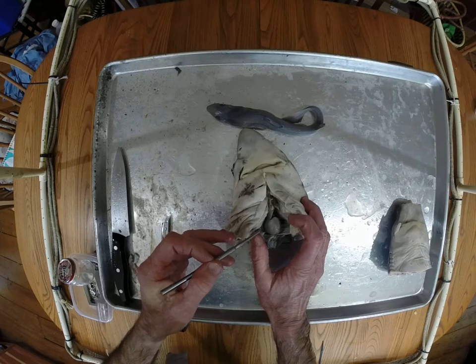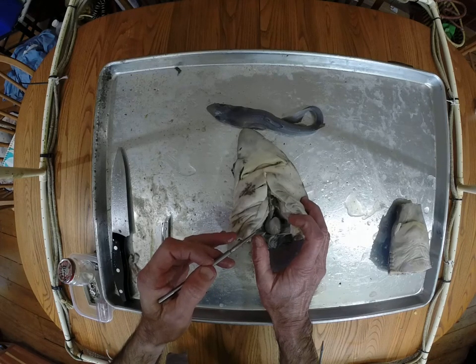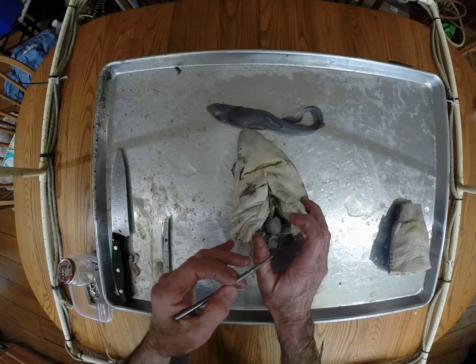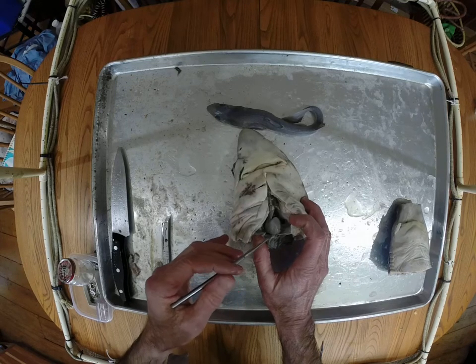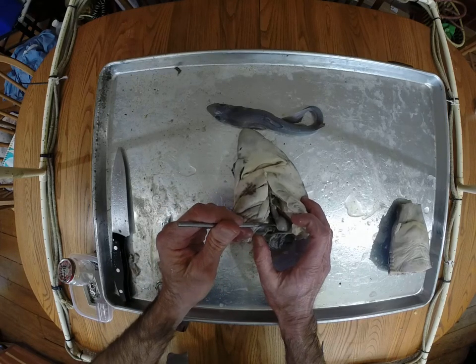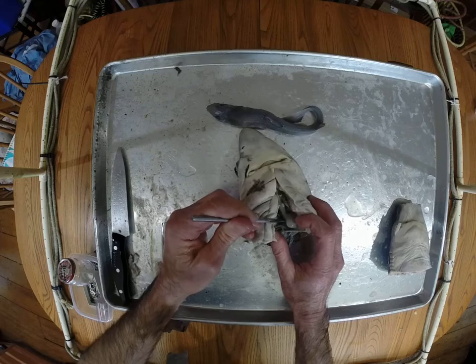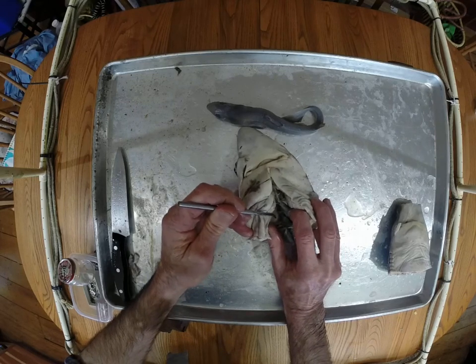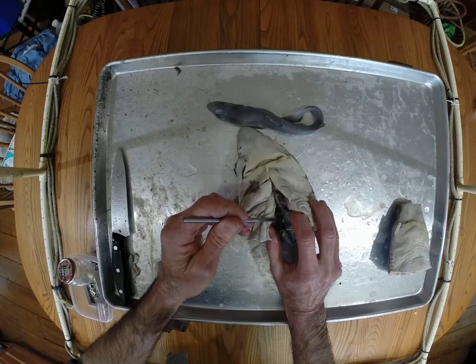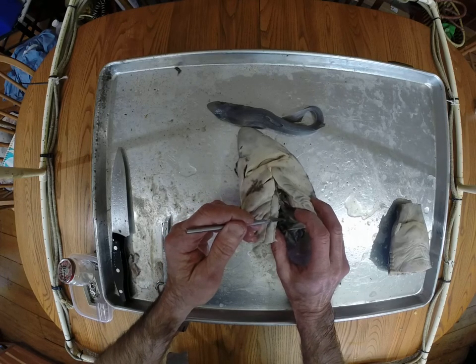And the heart in fish is a two-chamber heart. It has one atrium and one ventricle. So blood, returning deoxygenated blood from the body, is collected in a sinus called the sinus venosus, and then it flows or is drawn into, let's look at this, the atrium. So the atrium is the first chamber of the heart. Here, if I can get this out of the, there we go. And so this is the atrium. It's fairly thin-walled, isn't it? It serves to collect blood and then pump it into the muscular ventricle.